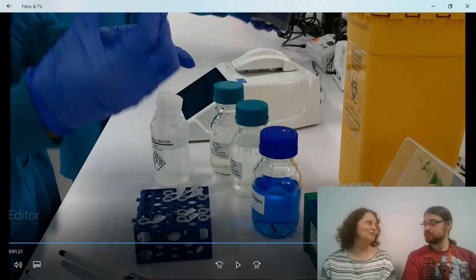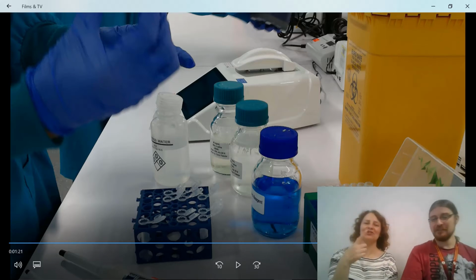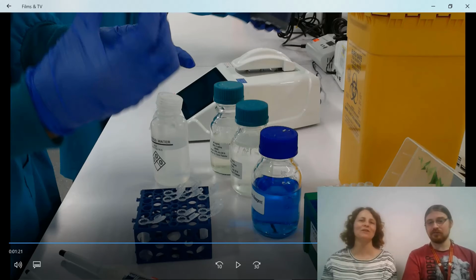Alternatively, you can also use the benchtop vortex. What happens when we use the vortex? You have to make sure that it spins completely up the sides. If it just bounces around, it's not going to mix properly. So if you're using it and you're not sure about your technique, make sure to ask your demonstrators, because they all know how to use them and they'll be able to tell you if you're doing it properly.